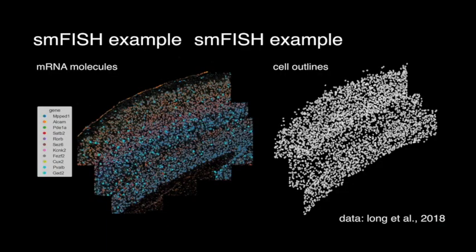And then finally, I want to give you a worked example. We took an smFISH data set from our collaborator here at the Allen Institute for Brain Science: 75 fields of view, 3 color channels, 9 rounds of imaging, which lets you resolve 27 genes, and processed it through starfish. Here's a plot of the spots color-coded by gene identity.